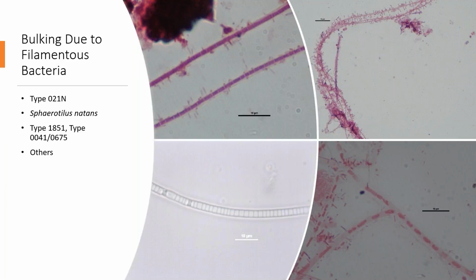which means it'll take up a large volume of space. You'll have a thicker sludge blanket in your clarifier, regardless of how much active bacteria you have. And it can be difficult to operate your plant because you don't have enough clear water to maintain good settling in the clarifier. So you could look at all of these filaments and assess what conditions they usually appear.